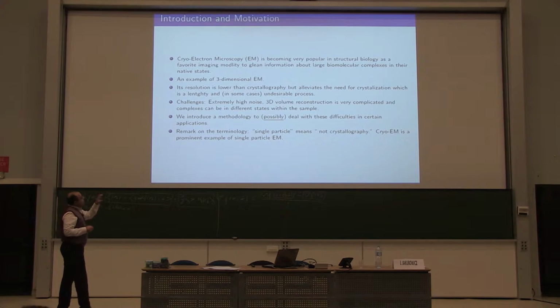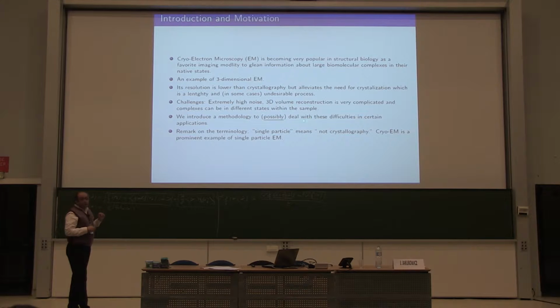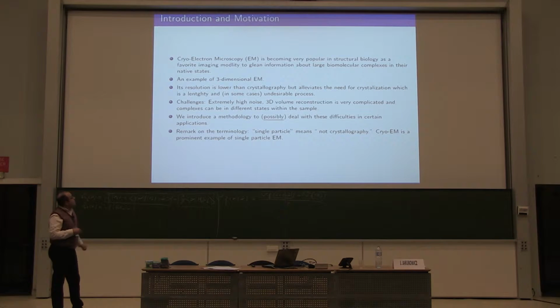This usually gives you much lower resolution than crystallography, but it's preferable in some applications, because crystallization is a lengthy process, and also in some cases you do not want your biomolecules to be crystallized, because they will lose their actual shape, and function will not be recovered from that shape.